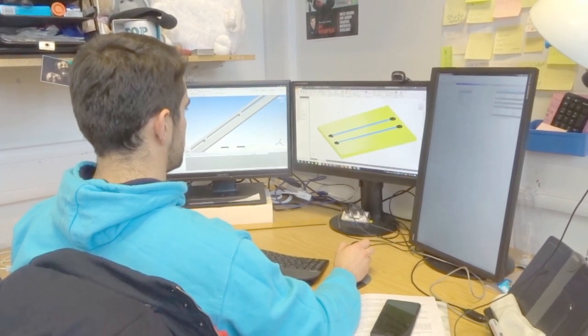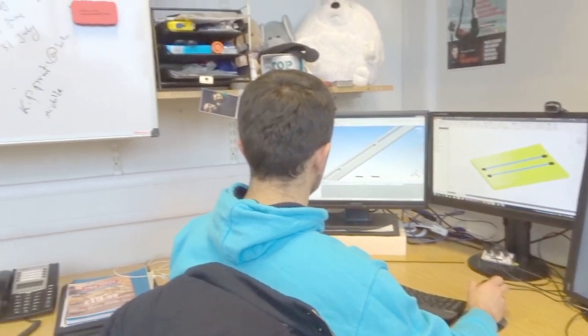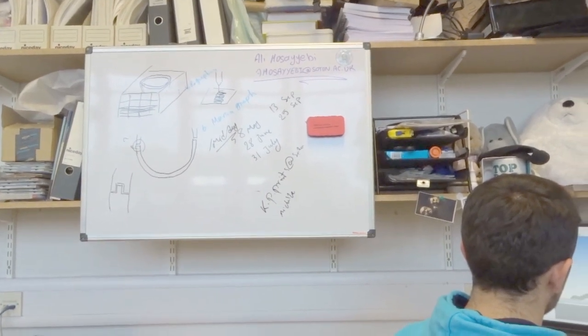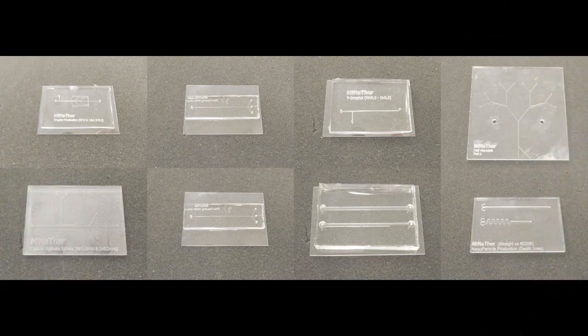The future of science is bright with microfluidics at the helm, with numerous benefits such as reducing waste products and the cost of reagents and allowing finer control of the molecular interactions. This technology can have a significant impact on not just bioengineering, but other disciplines as well. It all just depends on the design of the chip.